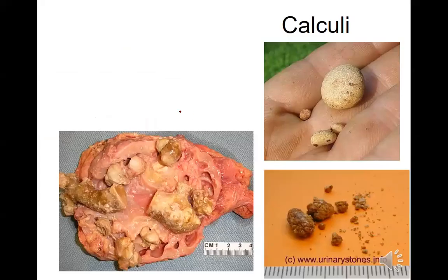This, of course, is a gross view of kidney stones, renal calculi, calcium oxalate, post-mortem. I mean, that's crazy how much. This is more what they're like, if you could pass them, you could. Sometimes they have you pee into a strainer while you're in the hospital dealing with the pain. And they'll take a look at what's exactly in these stones to see what the problem is. Is it a uric acid problem or too much calcium, which is more typical?